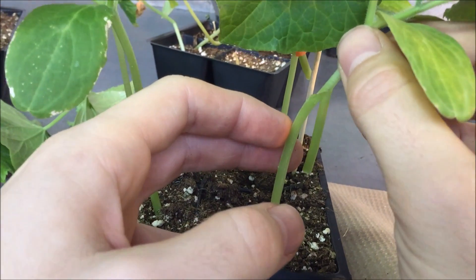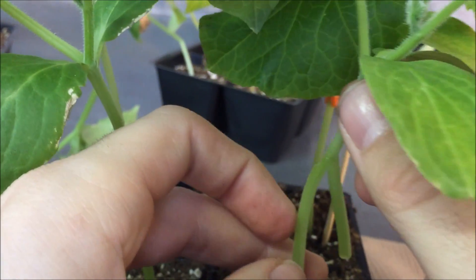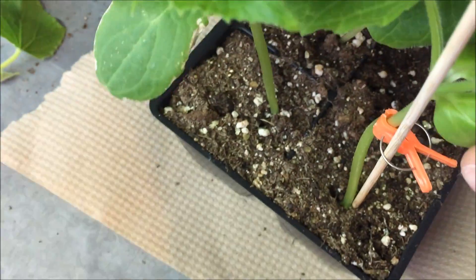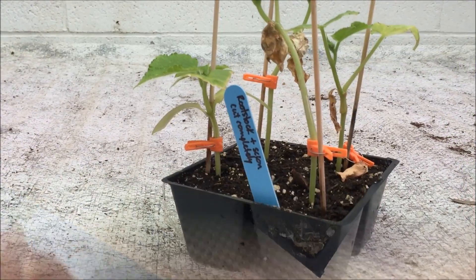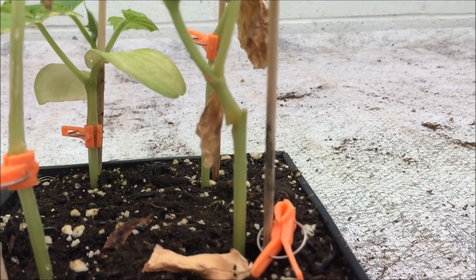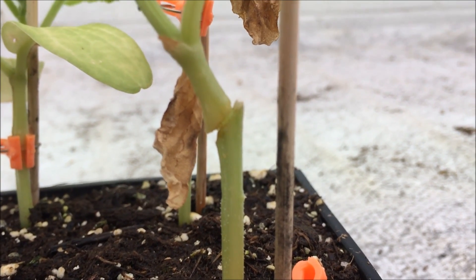Notice that now, the rootstock stem has been cut entirely, while the other manipulations remain the same. Using this new technique, we now have a much better graft success. We can see here that the graft union is well-healed.